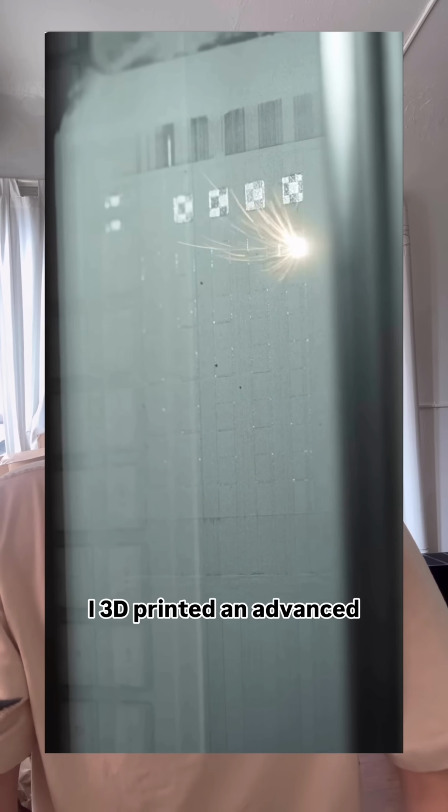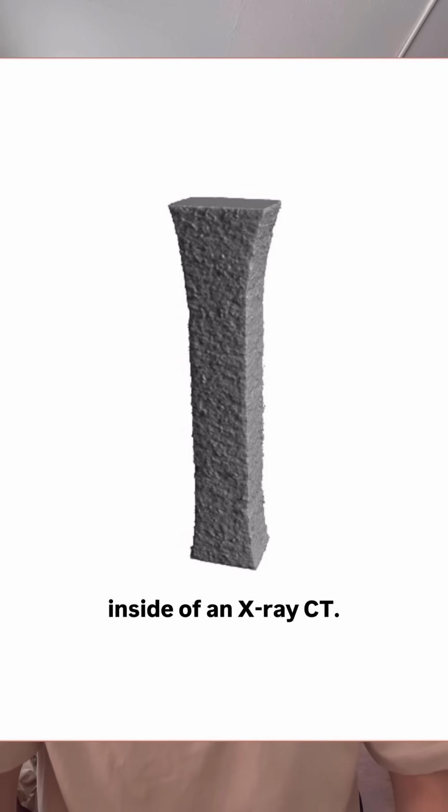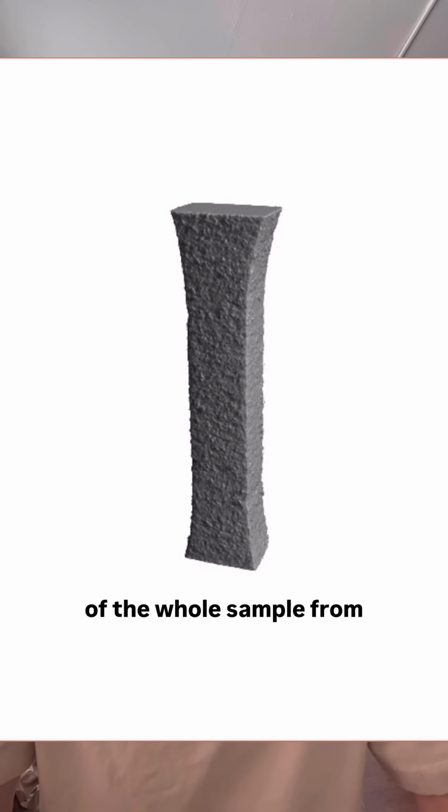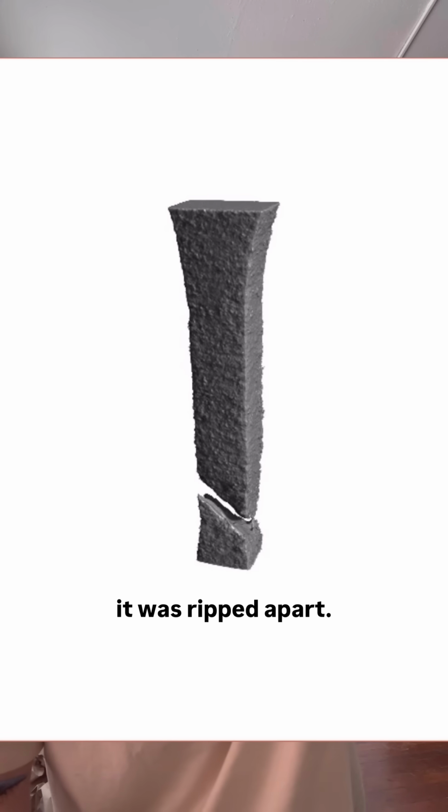I 3D printed an advanced alloy, then I ripped it apart inside of an X-ray CT. I took a bunch of 2D images as the metal was deforming, and then reconstructed a 3D model of the whole sample from start to all the way when it was ripped apart.